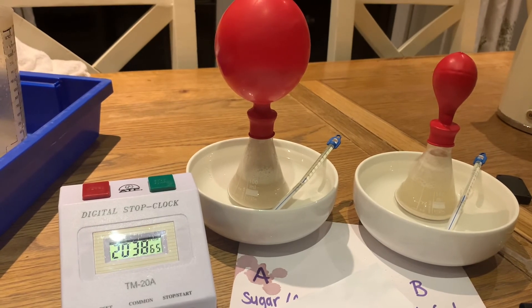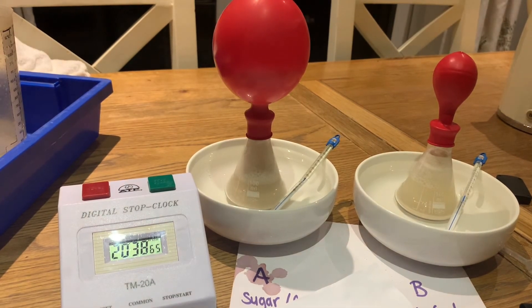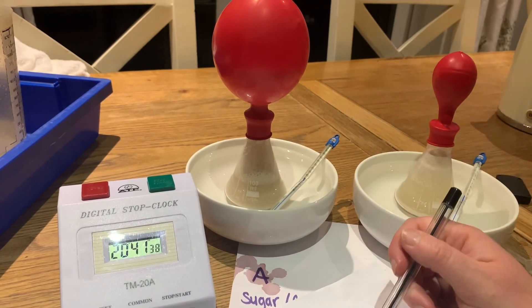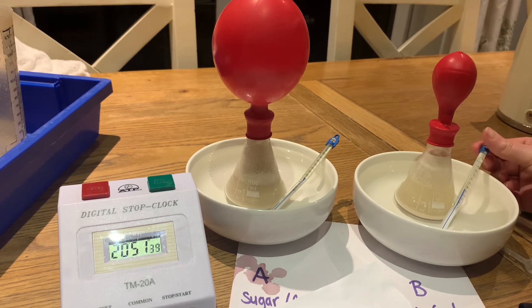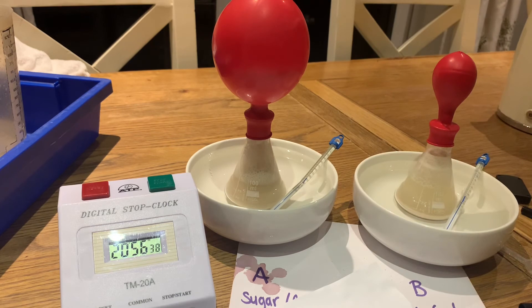We're going to measure both balloons to get our reading. On the 20-minute reading, flask A had a 30 centimetre diameter and flask B had a 12 centimetre diameter. We checked the water temperature and it is still at 36 degrees, so this is a fair test.